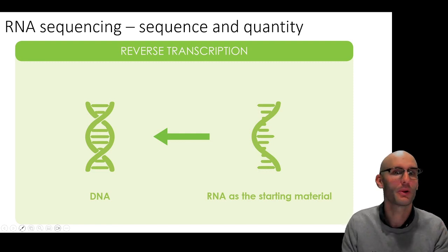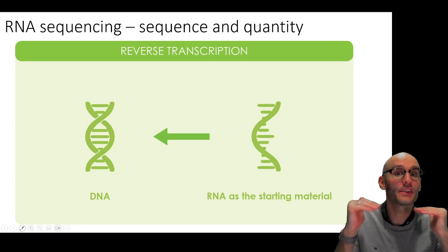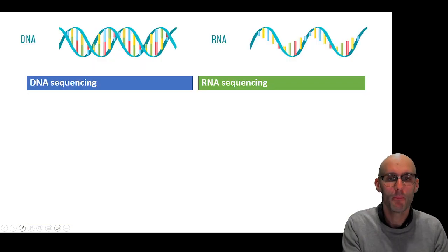So step one is we take the RNA, we keep it at the same levels, right? Because we want this to be comparative. And then we do reverse transcriptase. We turn it into DNA and then we sequence it.